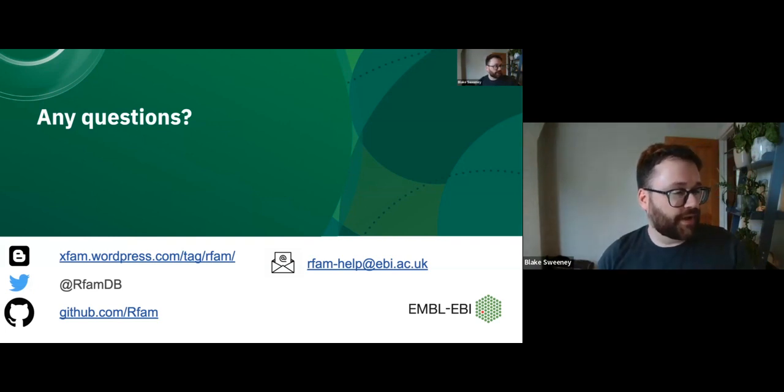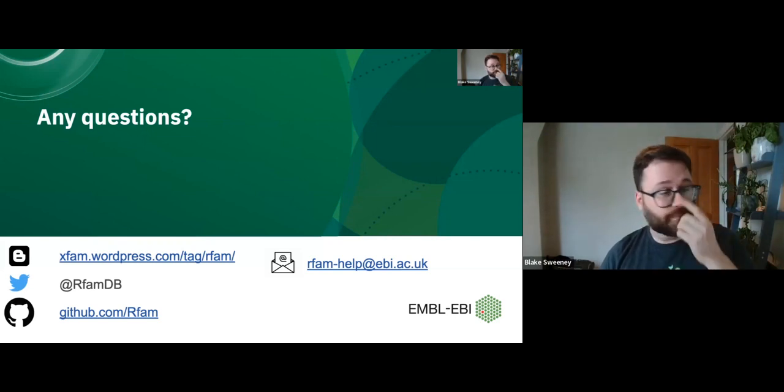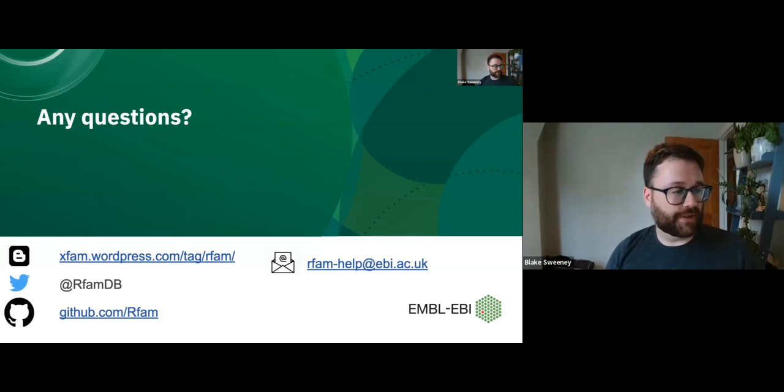George is asking about the online tool. We do have a tool where you can upload a sequence and we will analyze it with Rfam. Yeah, that does have a limit. We have a finite amount of resources, and so we do limit the size of sequences that we will run on our servers to annotate.